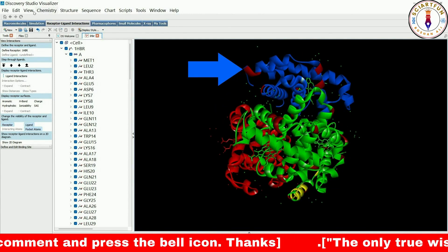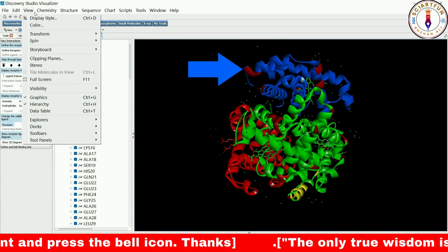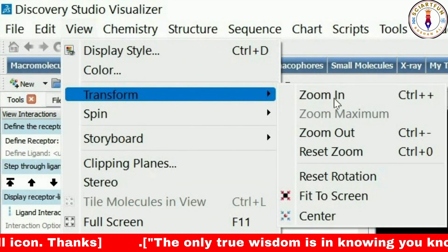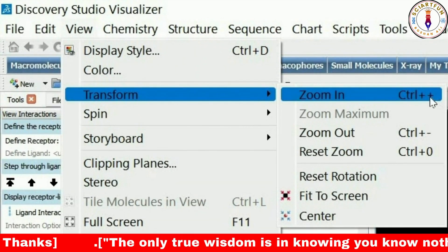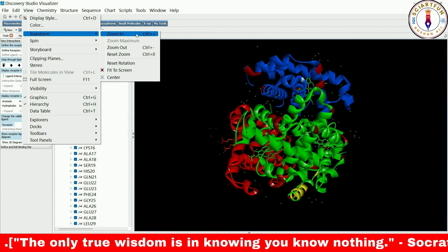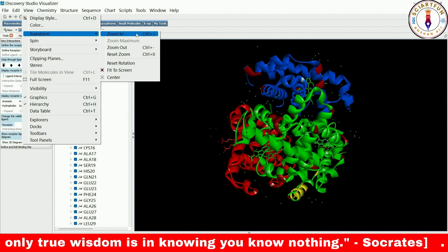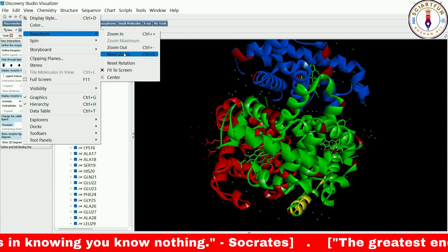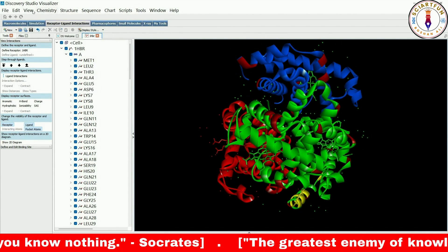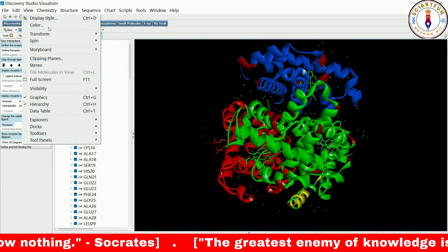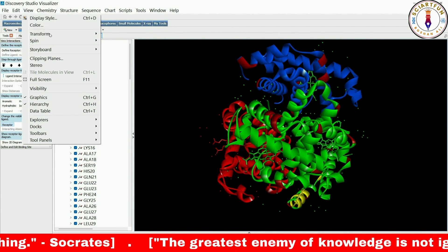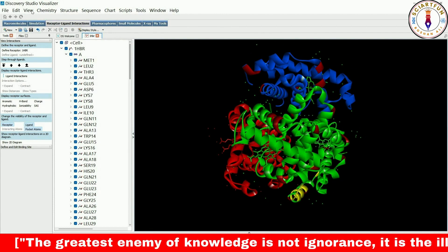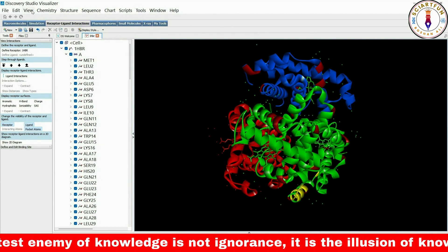Now let's move on to the second important option: Transform. The first option here is Zoom In, which brings the view closer to the viewer step by step. The Zoom Out option will move the model further away from the viewer. Being able to zoom in and out is an important tool for visualizing the protein structure at different levels of detail.